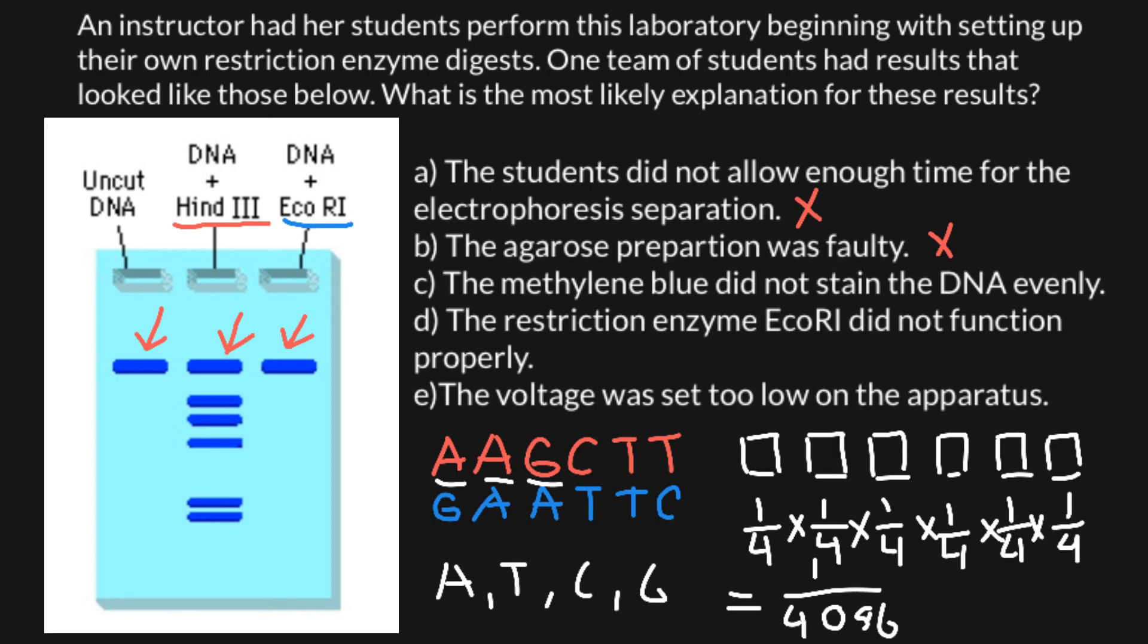Variant C: the methylene blue did not stain the DNA evenly. Also not the case, because we see that all the bands stained evenly, and we shouldn't expect any loss of bands here due to this problem.